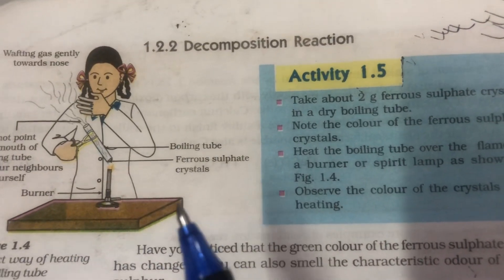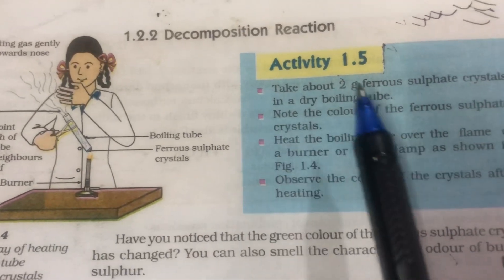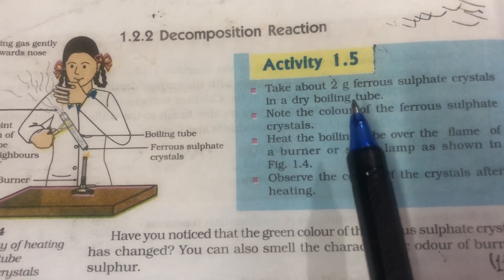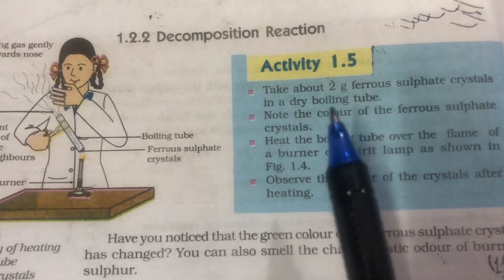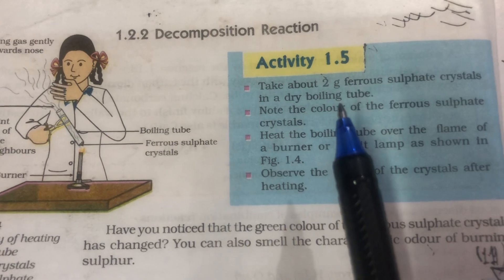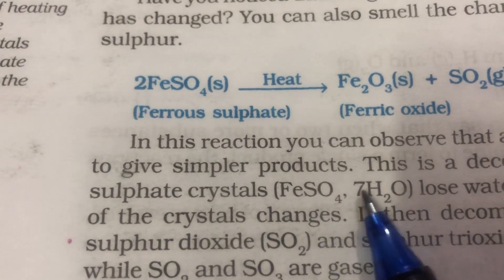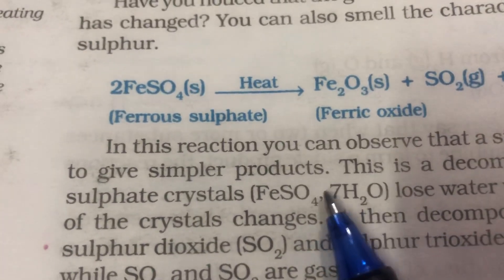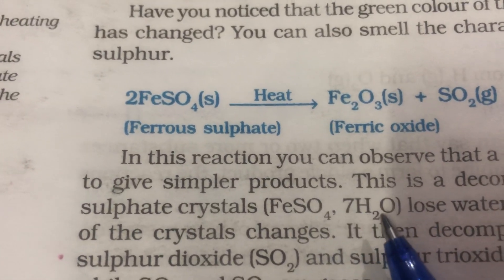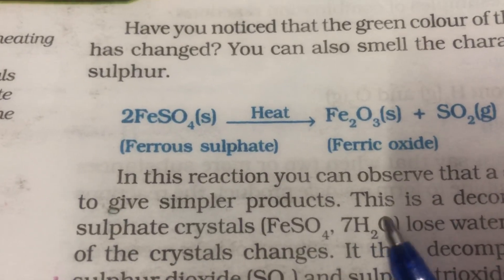Coming to the procedure, as you can see that in the test tube we have taken 3 grams of ferrous sulphate crystals in a dry boiling tube. Why should it be dry? Because ferrous sulphate crystals contain 7 molecules of water in them — FeSO₄·7H₂O. These 7 H₂O molecules are present in the salt and are not visible to us, but these 7 water molecules make the crystals green in colour.